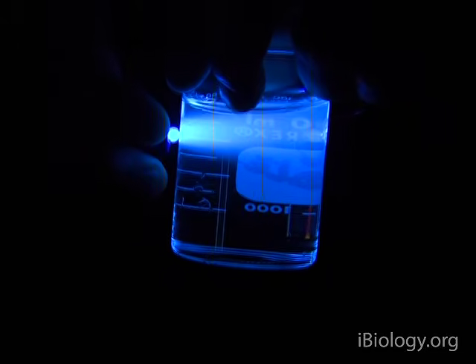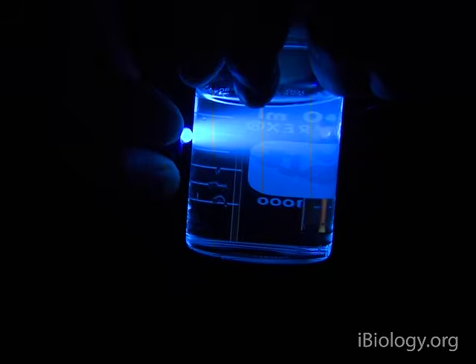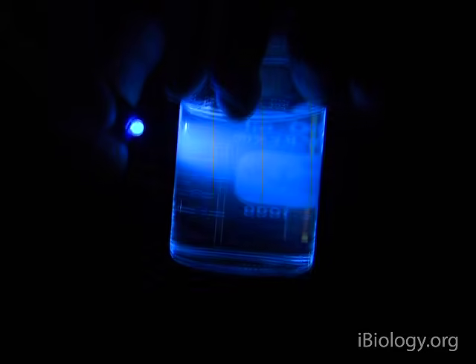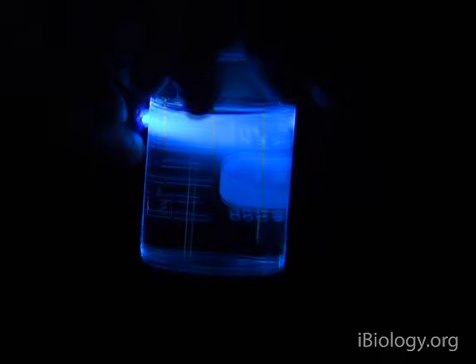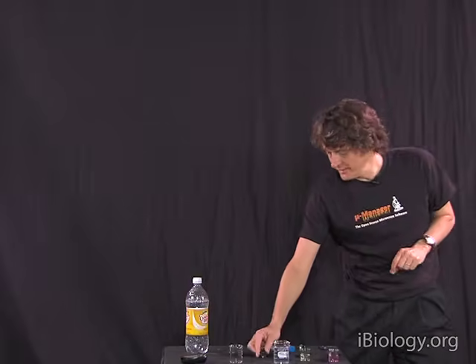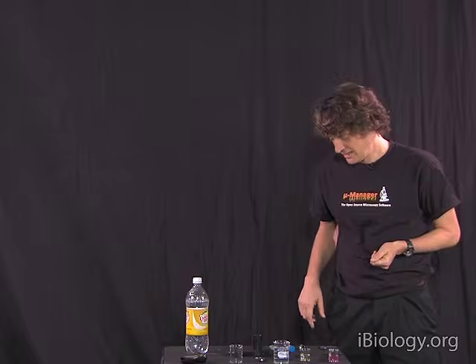It's another wavelength. It's a longer wavelength than the light with which I illuminate. And that's why we see it a lot better. Our eyes are not very sensitive to this UV, but they are highly sensitive to the blue light in the tonic water. Quinine is not the only compound that fluoresces, of course, otherwise it would be quite uninteresting.